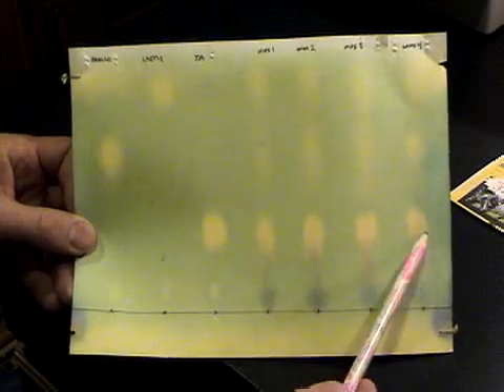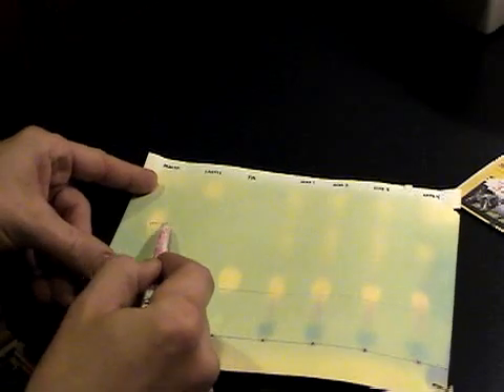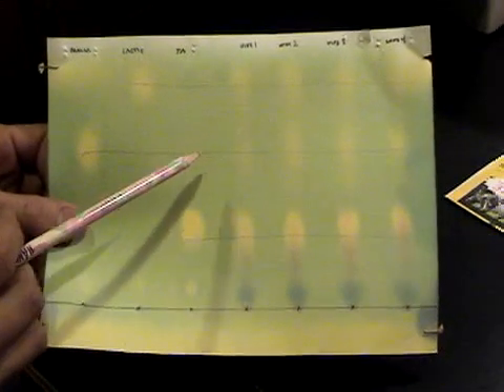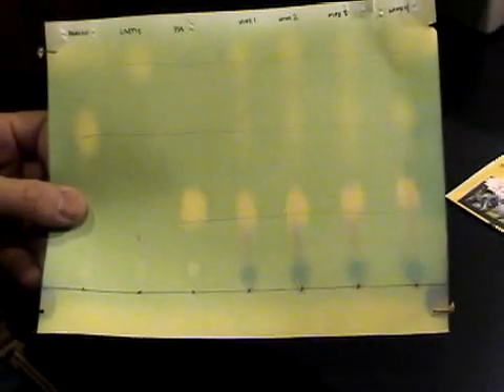So here's the developed chromatogram. Here's my malic acid standard, here's my lactic acid standard, and here's my tartaric acid standard. These are my four wine samples. As you can see, this is the tartaric acid because they're all lining up. This right here is where the malic acid is, and here's the lactic acid up at the top. Our goal is to convert the malic acid to lactic acid. Right now these spots on my chromatogram are very similar, telling me that malolactic fermentation is still happening and perhaps it's halfway through. Based on how long it's been going, I would have to say that mine's happening rather fast.